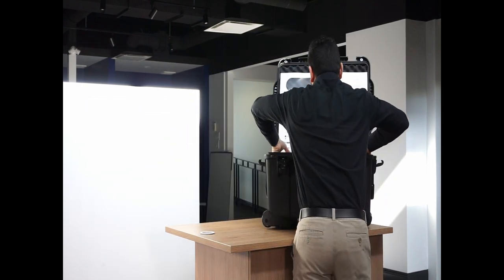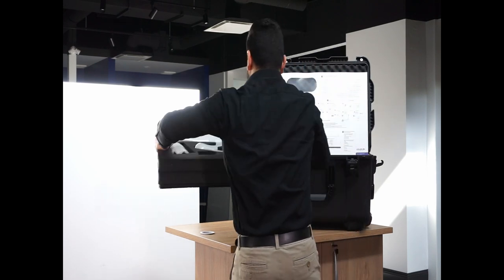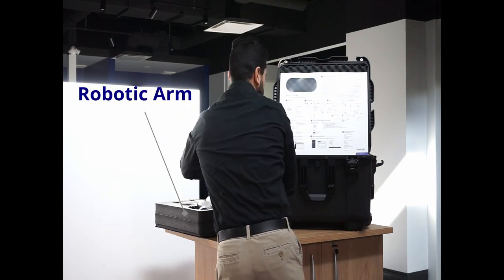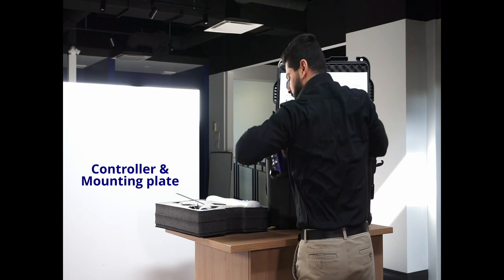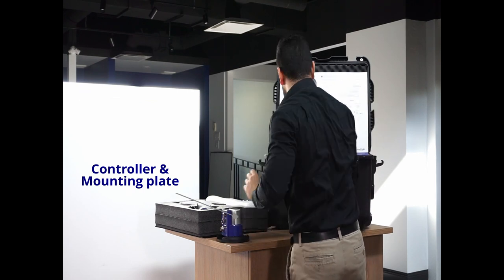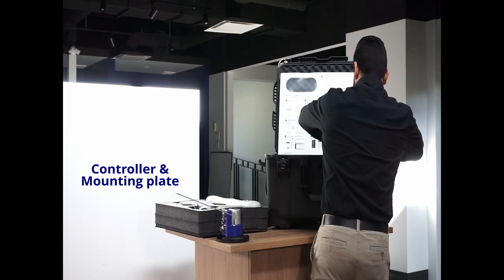In the first stage of the box, you will find your robotic arm. Then, in the second level, you will find the controller already mounted on the mounting plate and the table clamp.